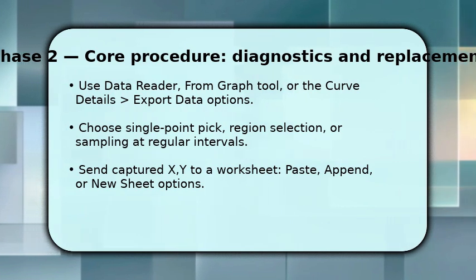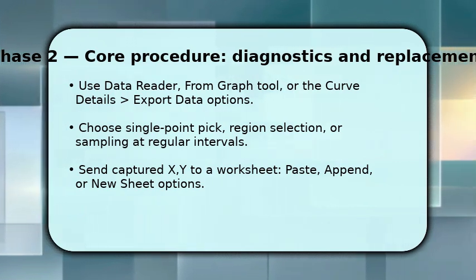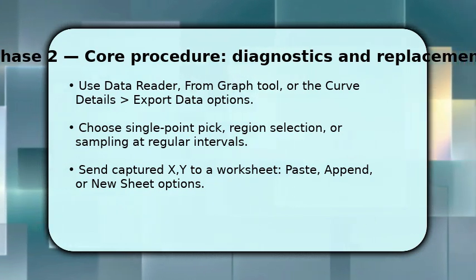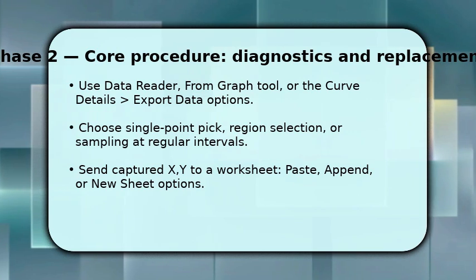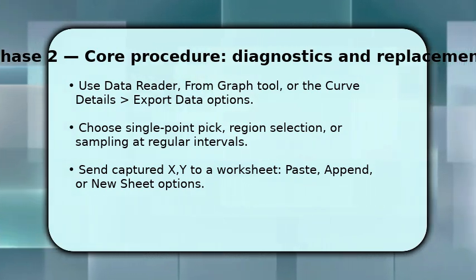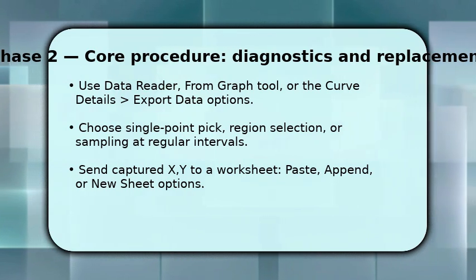Once you have the selection, send results to a worksheet by using the paste or append commands or the built-in export dialog that creates a new sheet. Make sure to name columns and units as you export, so downstream analysis is consistent and traceable.